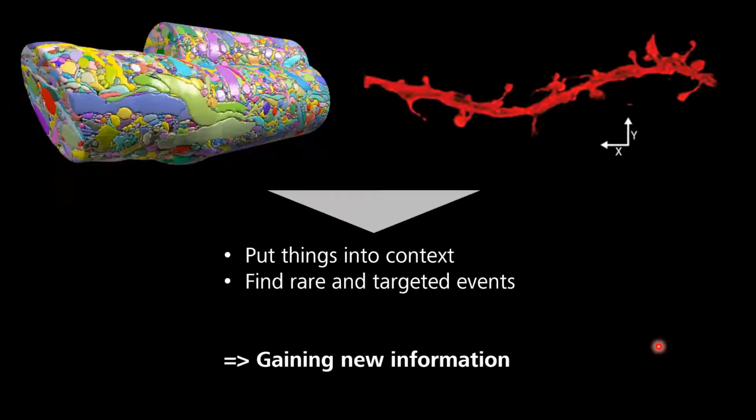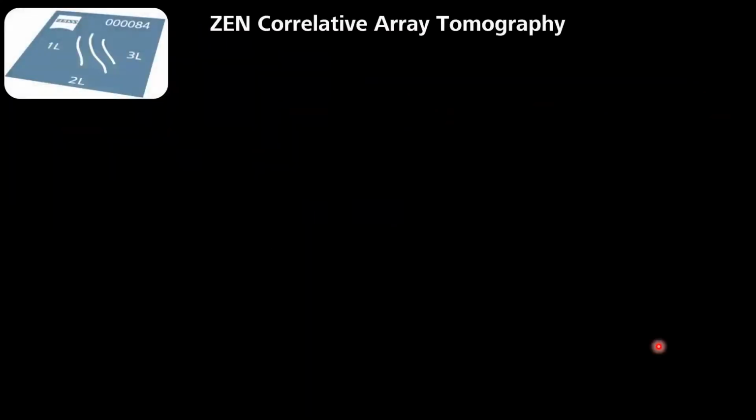We want to be able to answer scientific questions that we haven't been able to answer before. Let me drive you through one of the correlative light and electron microscopy workflows. And just keep in mind, this is not the only one. There are probably as many workflows as you could imagine, and then some. But this, I think, is a workflow that's very easy to understand.